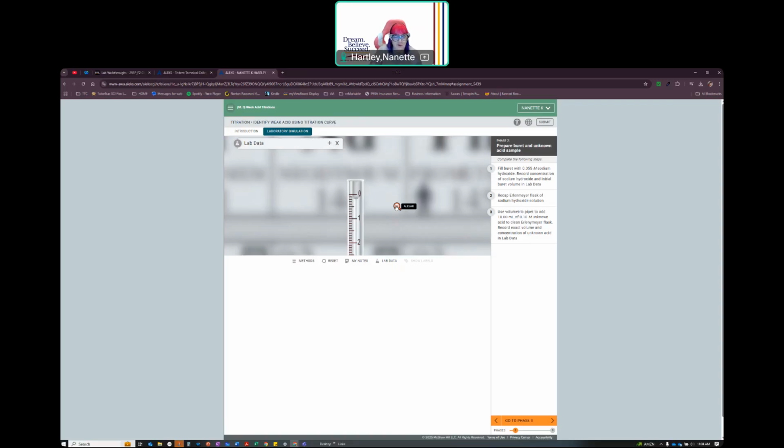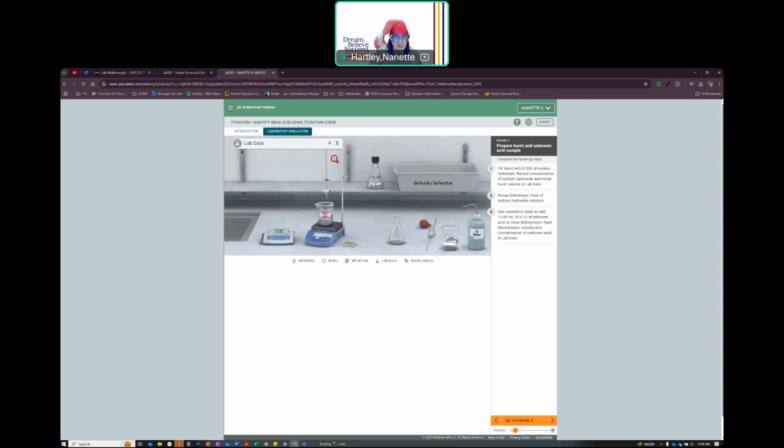Okay, awesome. So I'm going to scroll back out, put that back on there. So record concentration and initial burette volume in the lab data. I did that. Recap the Erlenmeyer flask. I did that. Use the volumetric pipette to add 10 milliliters of this guy right here to the clean Erlenmeyer flask.